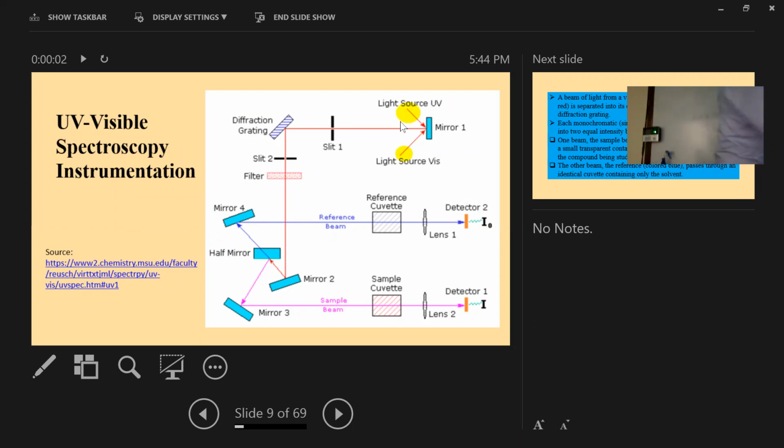That means diffraction means, if you have some obstacle in front of your light, it will try to bend the light and it will generate some fringe. That means some portion bright, some portion dark, some portion bright, some portion dark, like that way. But I could not show you. I'm sorry.